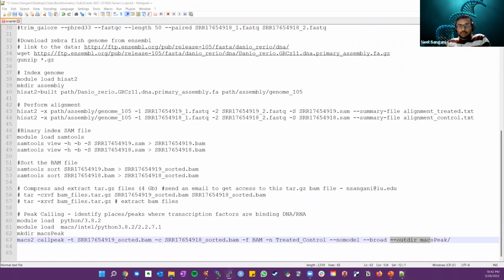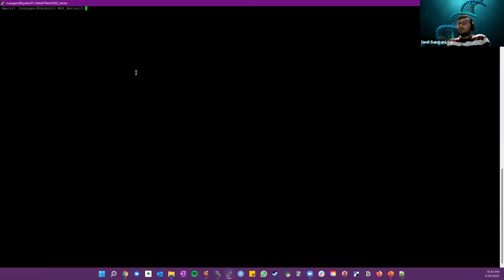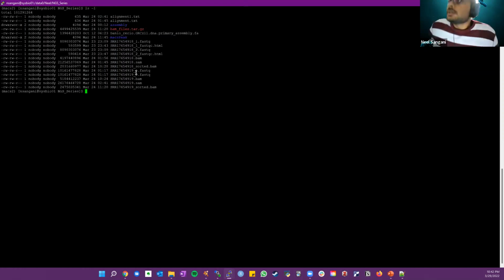So quickly looking at some of these files, I have run a few of these already.